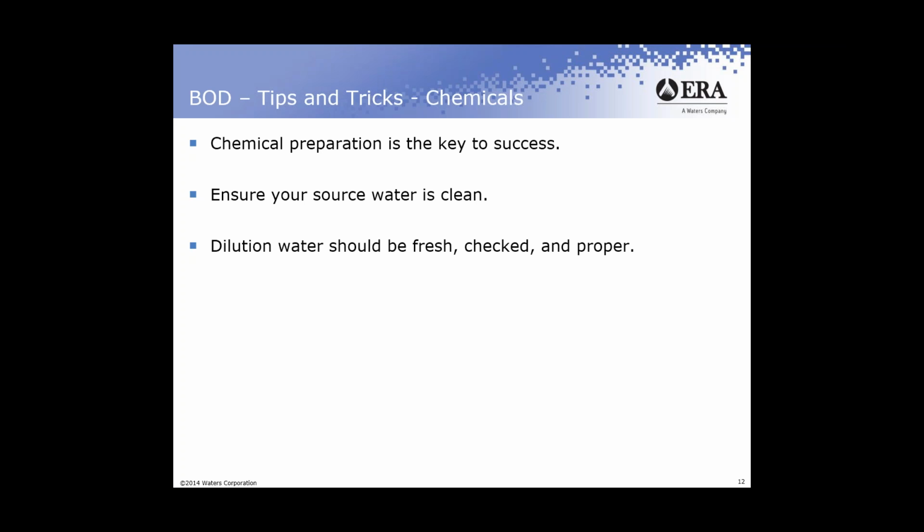So remember, when you're making up your dilution water, the source water that you use is important to be free of both chlorine and those heavy metals, and also not to contain any microbes themselves. Distilled water works great. If you have distilled water available, that really works good for you, making sure that the source of your distilled water is not from copper kettles, because you don't want to introduce any copper in there. Deionized water will also work well as long as you're sure that it's free of organics and it's free of microorganisms. There is a potential for both in deionized water.